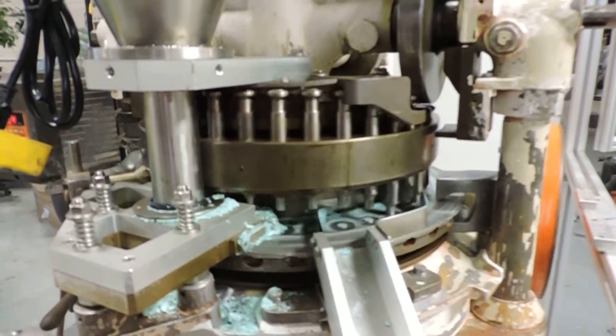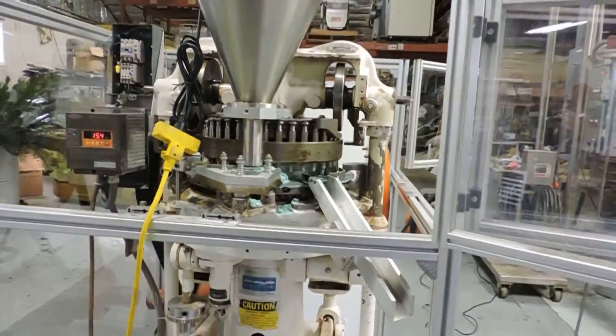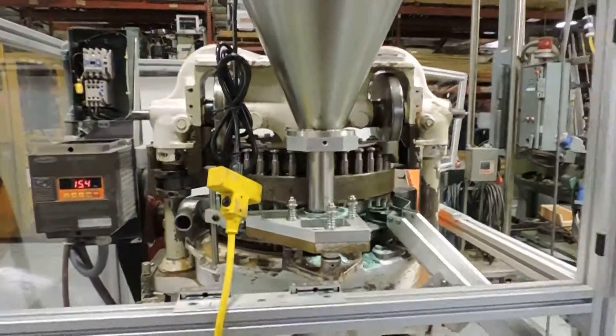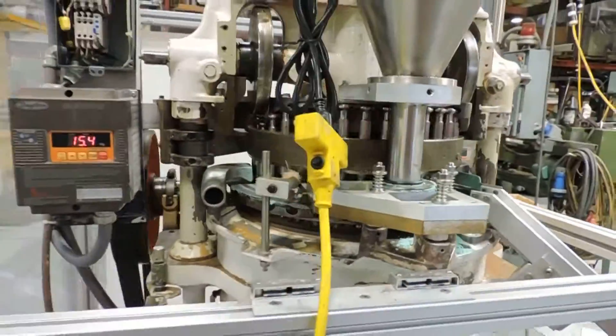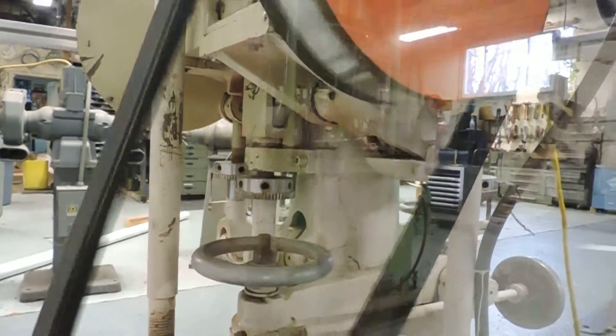Unique feature: it has one central loading position and three pressing stations. You can see the standard ones on both sides, then around the rear of the unit is the third pressing station, which has an upper and lower compression roller.